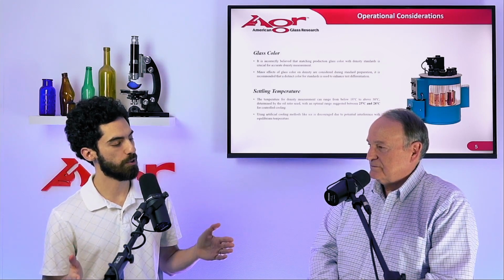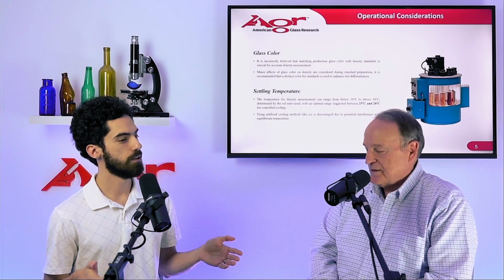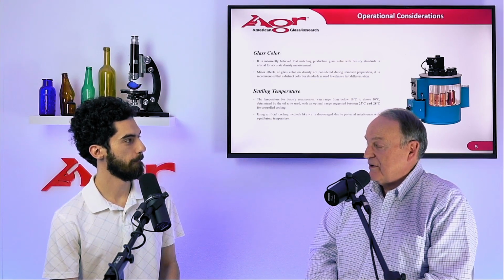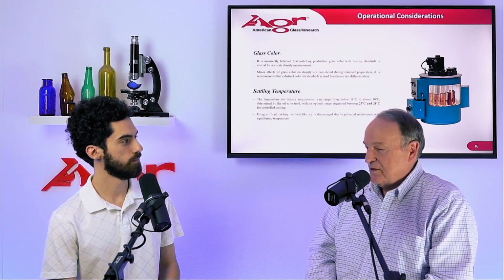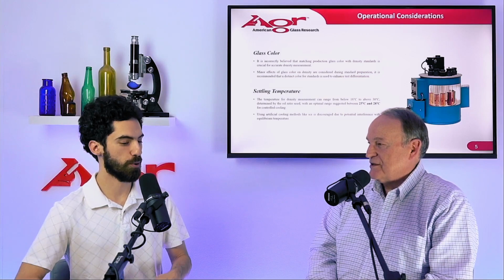So as long as we're within that set range, which I'm sure you could find in the operator's manual. It is. It's just whatever's convenient to you. Yes, and you should adjust it to be convenient for you, depending on the time of the year and whether you're using city water to cool the bath or well water. Absolutely, you should never use artificial means of cooling that water bath, such as throwing ice cubes in.